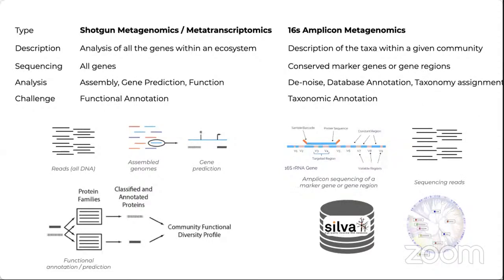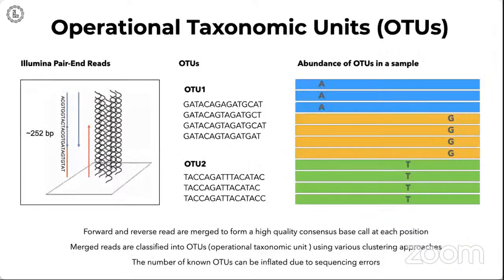How are they generally performed? In addition to sequencing, these PCR amplified products of the 16S rRNA gene, we pool them, or we generally cluster them in groups of closely related individuals as defined by their sequence identity or sequence similarities, right? These consensus sequences are defined as operational taxonomic units, and their abundance is characterized and quantified for different samples.